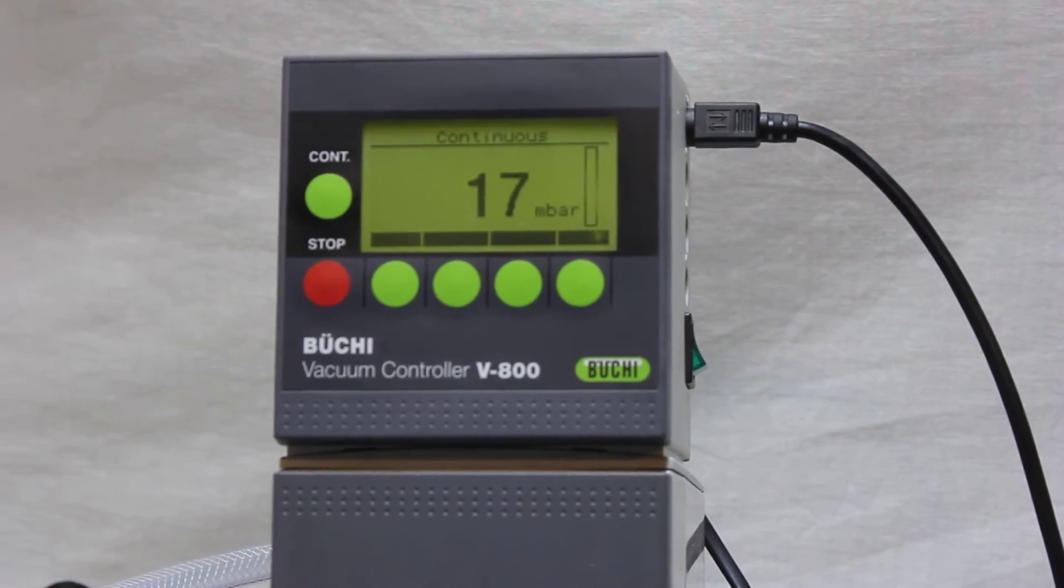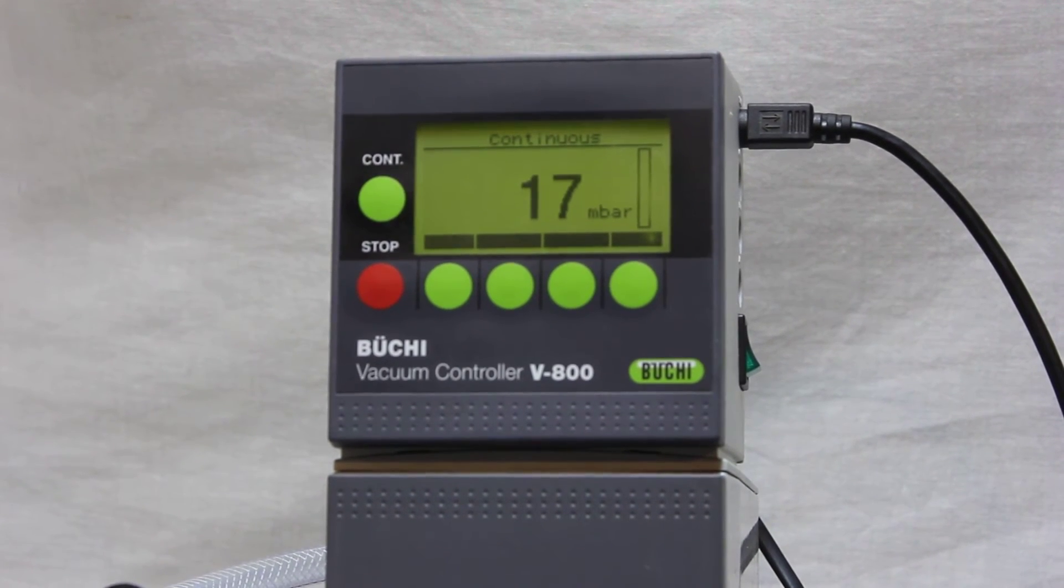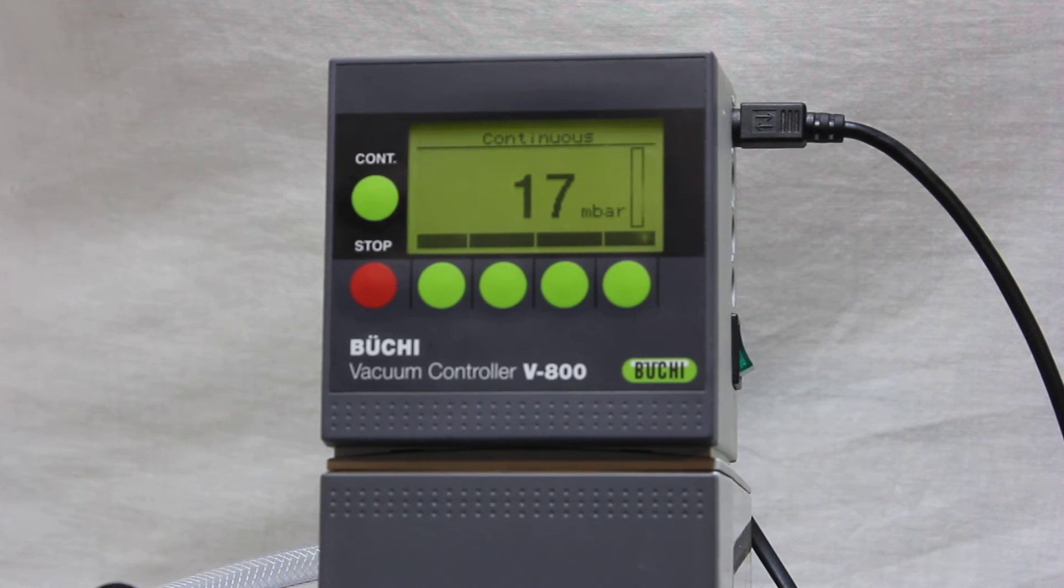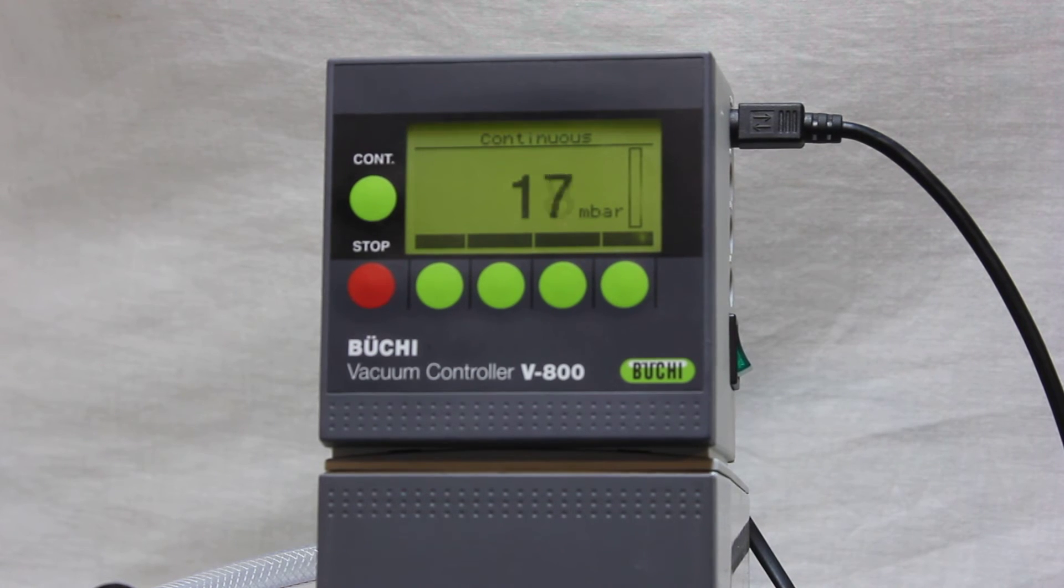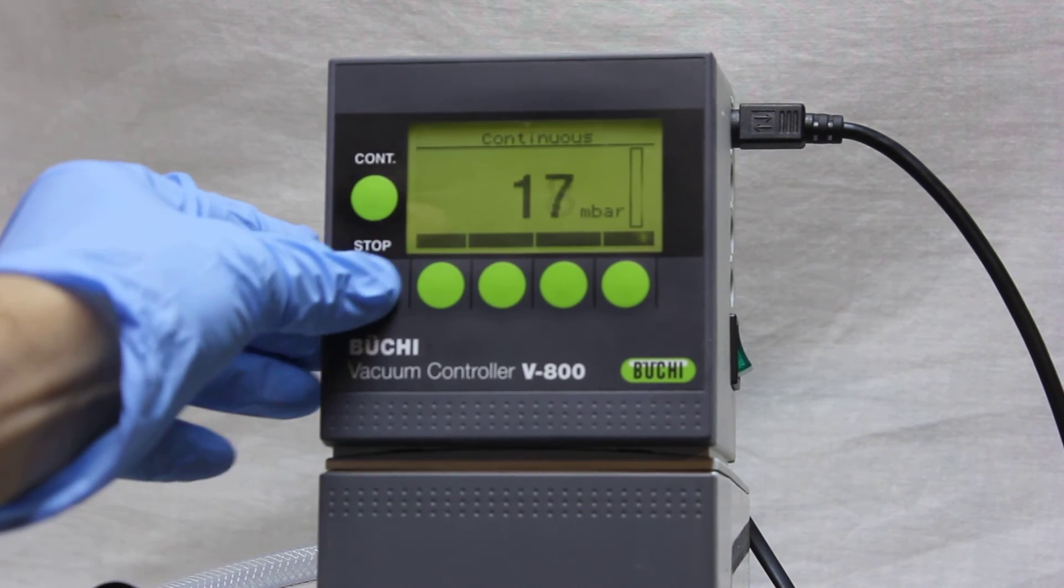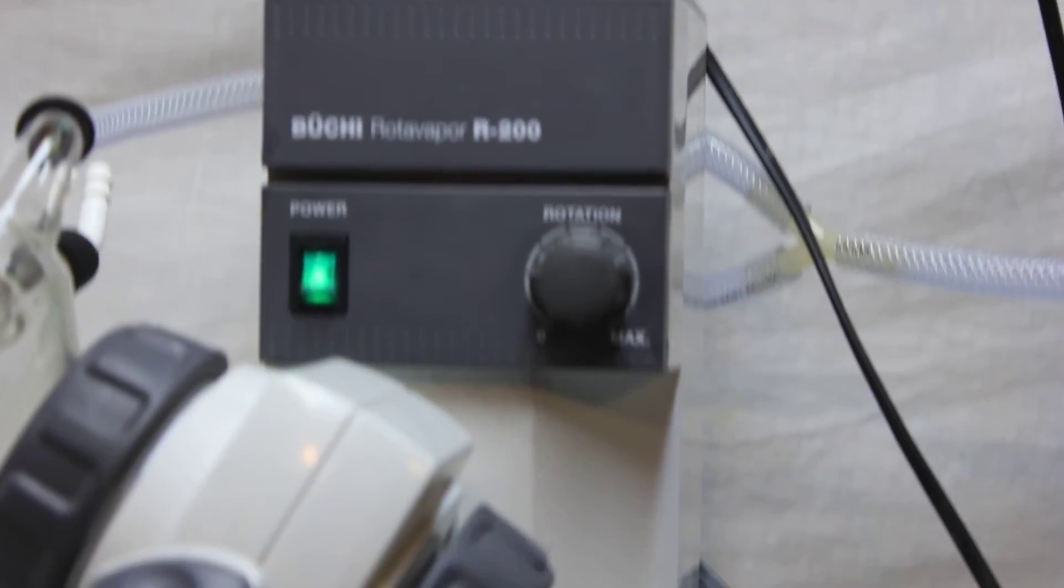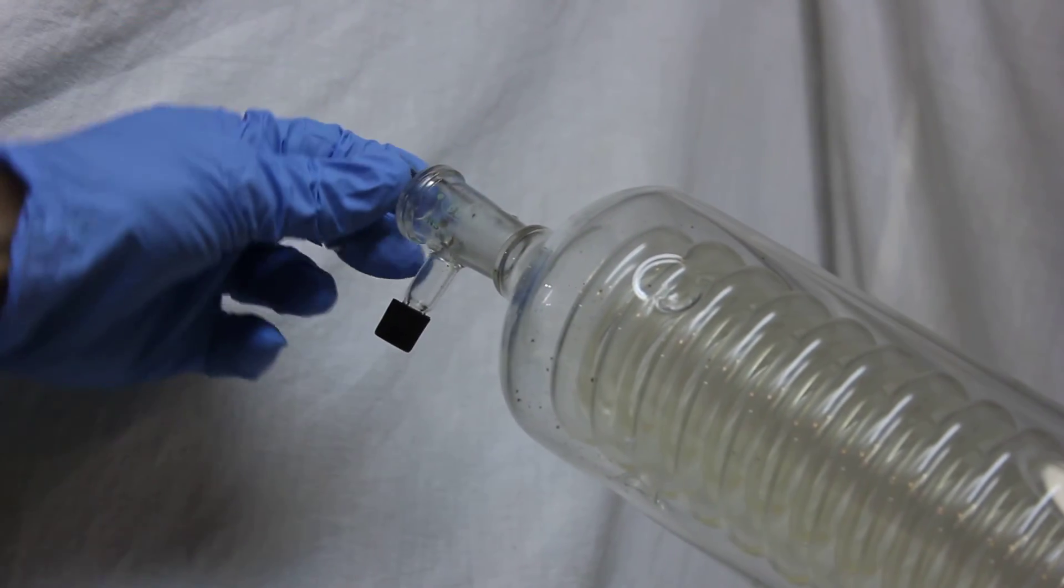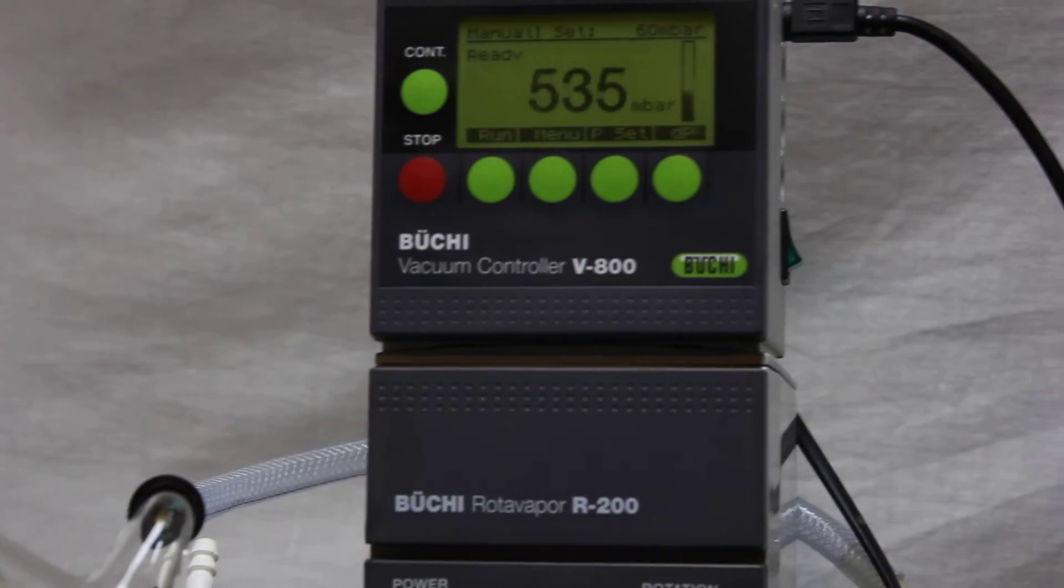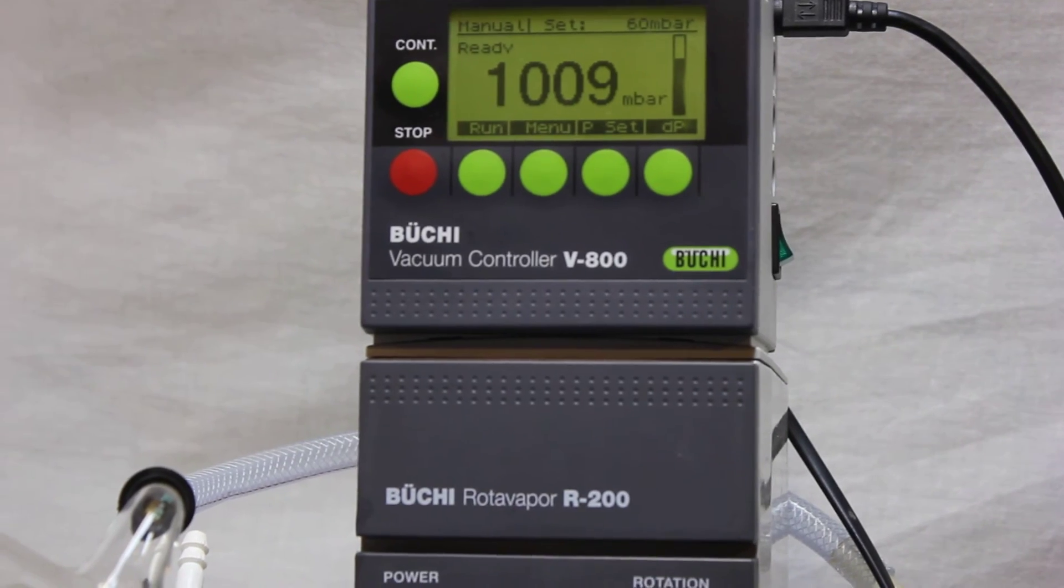Basically 17, 18 millibar. Another test you can do: I can turn off the vacuum controller. You see it still remains on 18 millibar. But as soon as I open this valve, you see it goes back to atmospheric pressure.